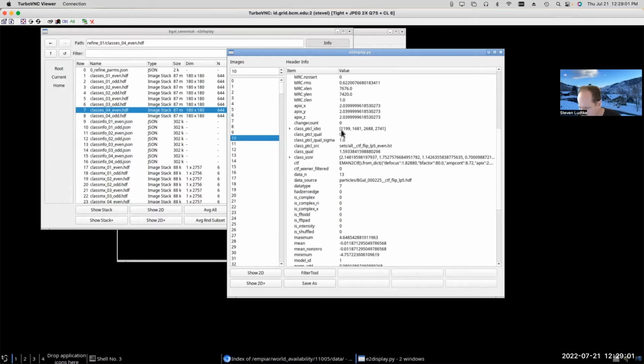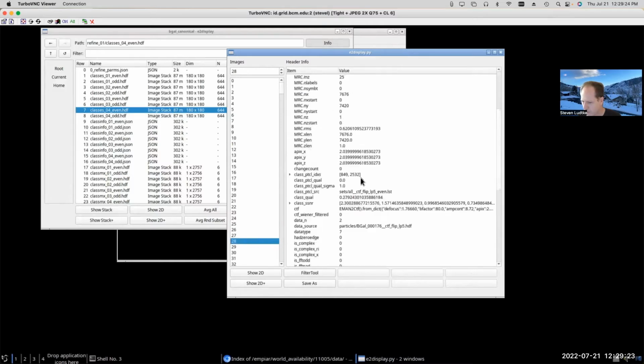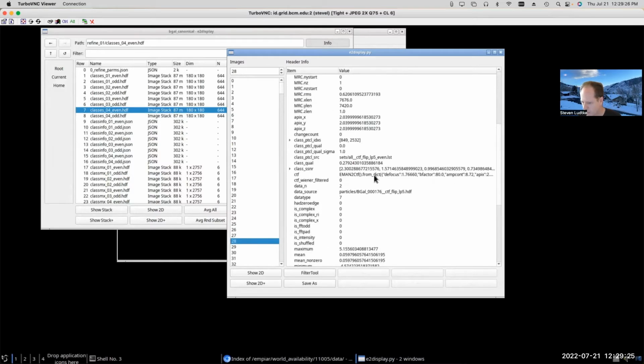We will also have another field, or I guess there weren't any excluded here, but if there were particles that were classified in this class but then excluded, there would be another metadata field which would contain the list of those. There weren't any in this case, so that's missing. I wonder if we'll see any in any of these others. You can see the ones that are missing metadata entirely are the class averages which didn't have any particles associated with them.